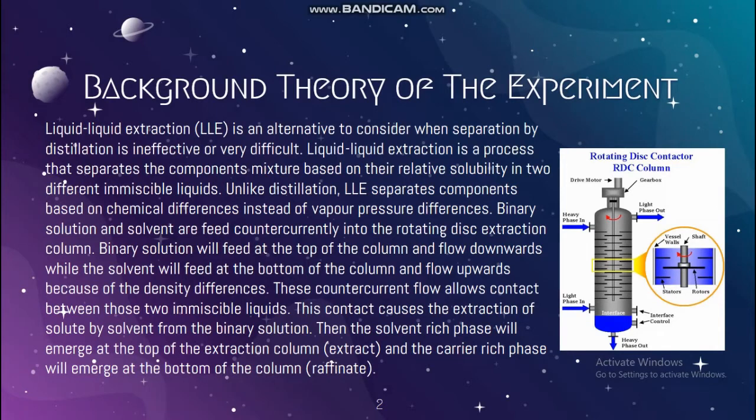Liquid extraction, also known as LLE, is an alternative to consider when separation by distillation is ineffective or very difficult. Liquid extraction is a process that separates the components of a mixture based on their relative solubility in two different immiscible liquids. Unlike distillation, LLE separates components based on chemical differences instead of vapor pressure differences.